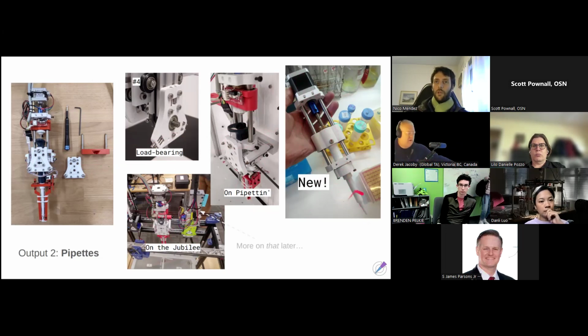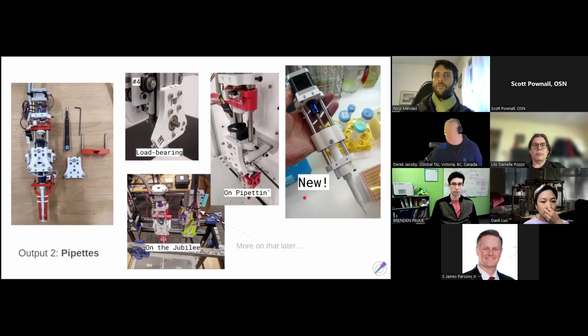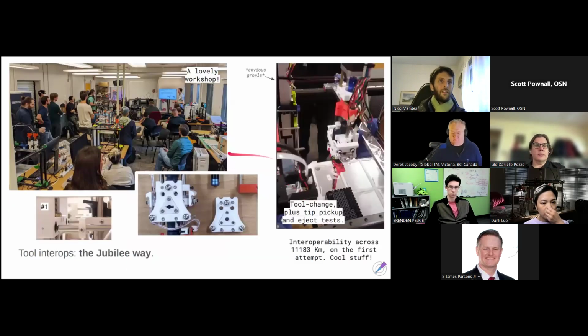This is a multi-pipette, multi-tip tip holder, so you can fit any of the three kinds of tips in there. And after a few manual tests in the lab, spinning it by hand and weighing it, it actually works quite well with all three tips, although this has been just this week. So I'll keep you posted on that. Here is the workshop we were just talking about.